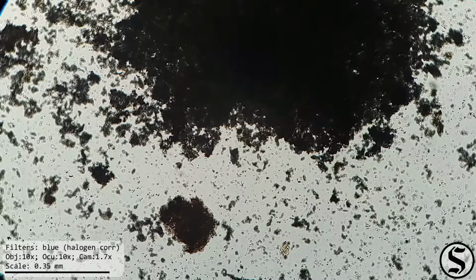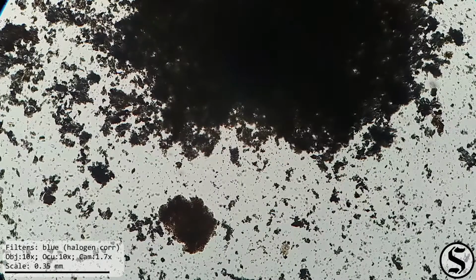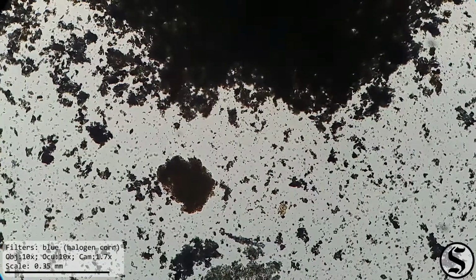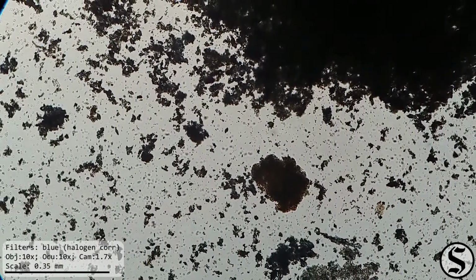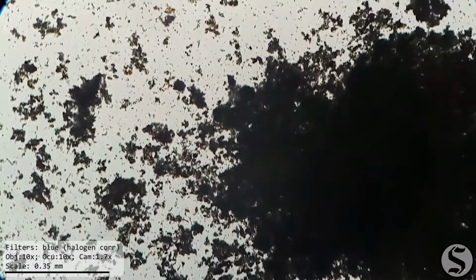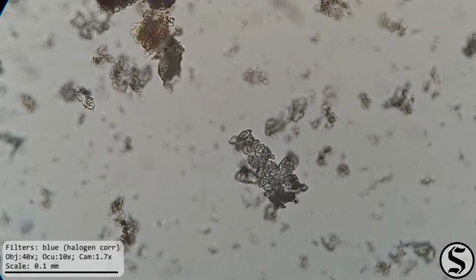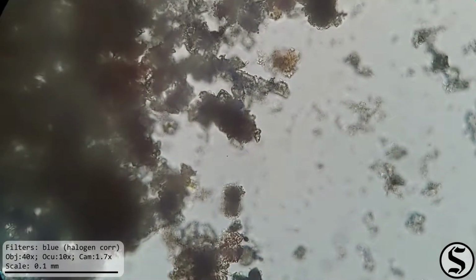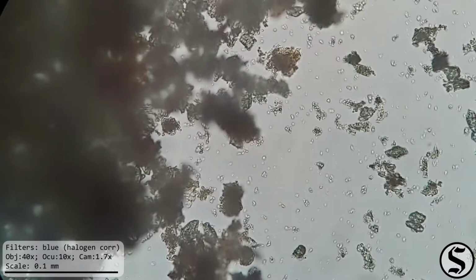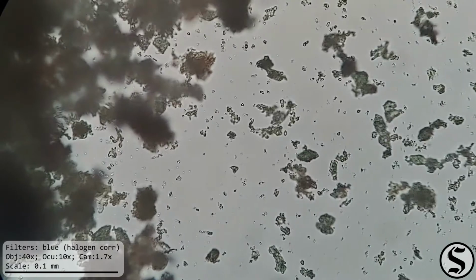And of the inorganic fraction, calcium carbonate at these temperatures is the major leftover material. And of course, there's a multitude of other oxides that are left over from combustion. Most of the darker stuff is probably carbon-containing compounds. And here at really high magnification, we can see that we've got a variety of particle sizes. Again, still that huge blob on the left, but a collection of particle sizes scattered about.